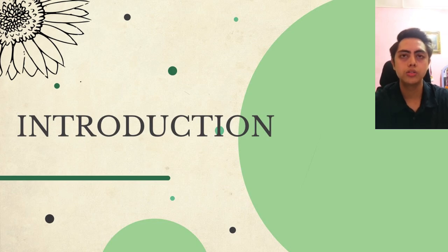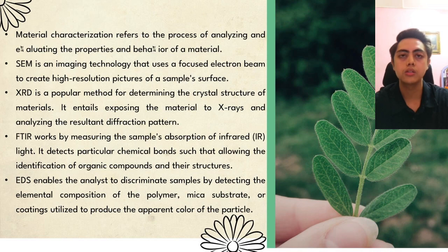So I will introduce the introduction of our project. Material characterization is the process of analyzing and evaluating the properties and behavior of a material. First, the technique is SEM, an imaging technology that uses a focused electron beam to create high resolution pictures of a sample surface.